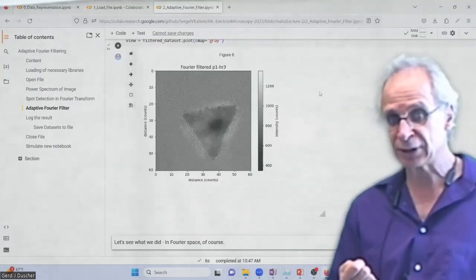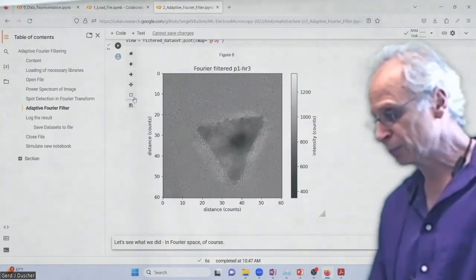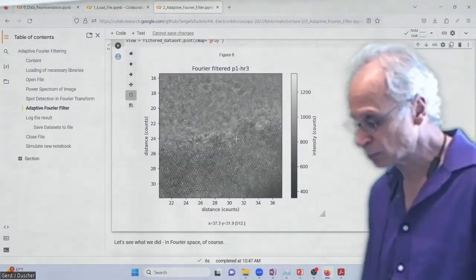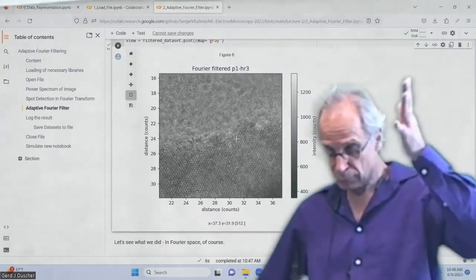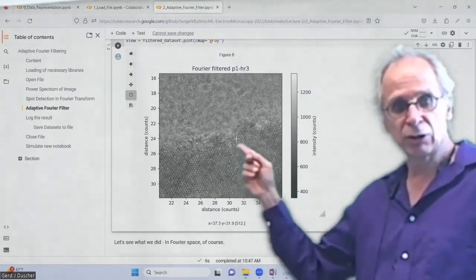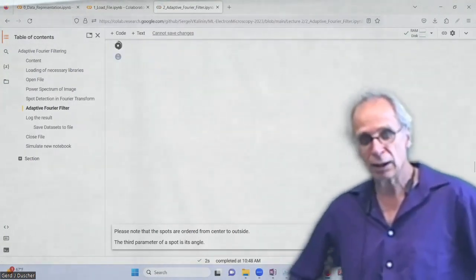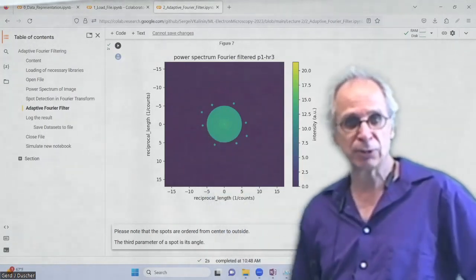There is a bit of an inconsistency still, because I'm switching over to angstroms for being compatible with simulations, which always use angstroms. So it looks already a little bit less clean. And if we look in the Fourier transformation, we see exactly what we did. We just allowed much more noise, right? The noise in between here is what we allowed.